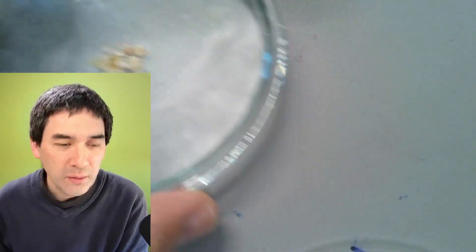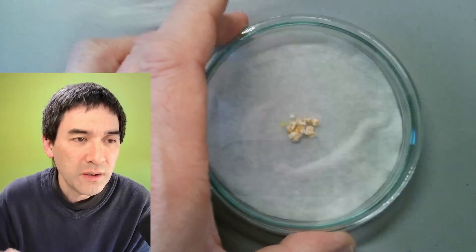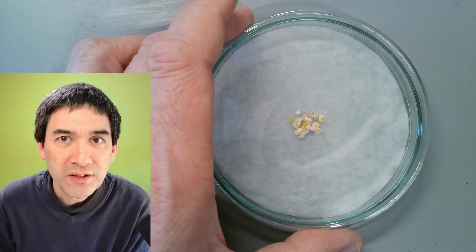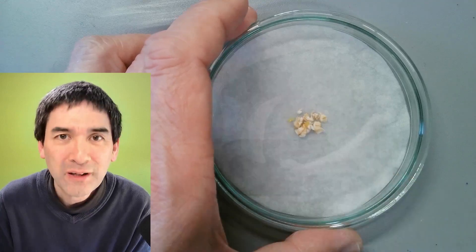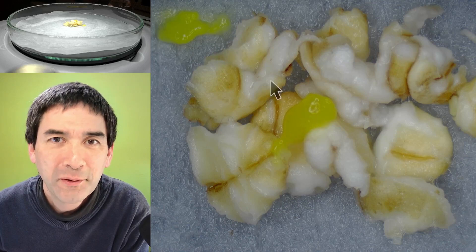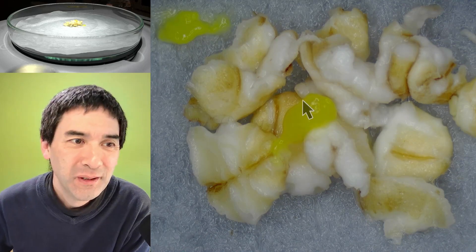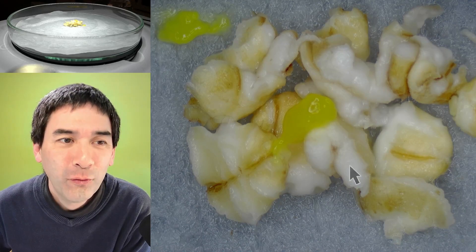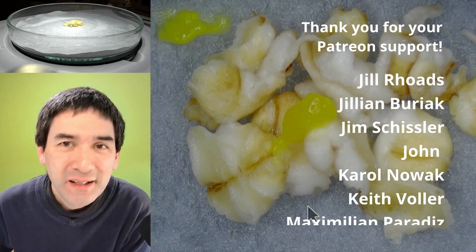Now I'm going to wait for a few days and see how this develops. But before that, let me show you how this also looks under the stereo microscope, so you can see that there is indeed a little bit of slime mold now on the cereal. Follow the arrow — that yellow blob here, and also over in the corner, that's the slime mold. The rest is cereal. Over the next couple of hours and days we'll see how it starts to move and cover the food, and then after a few more days it'll start spreading again.